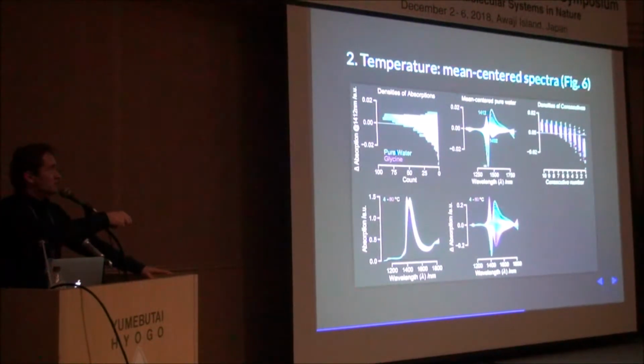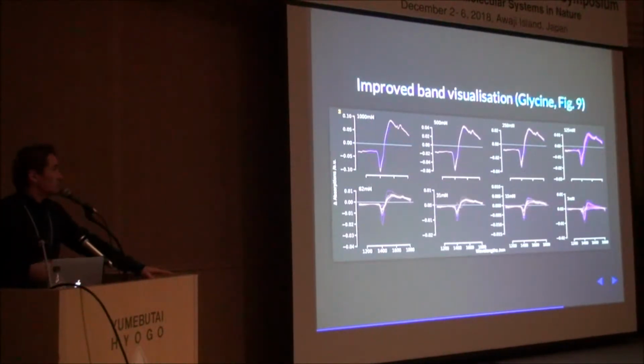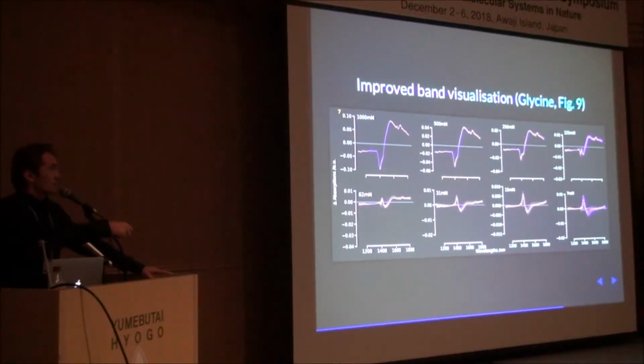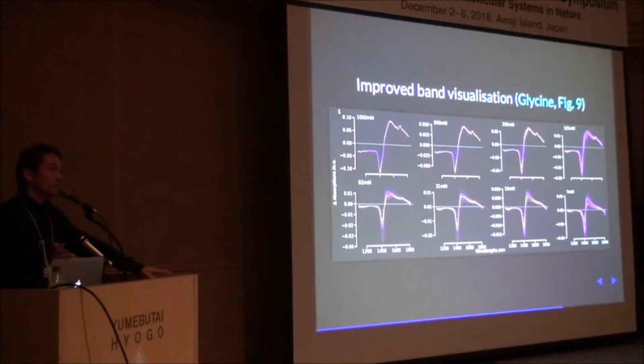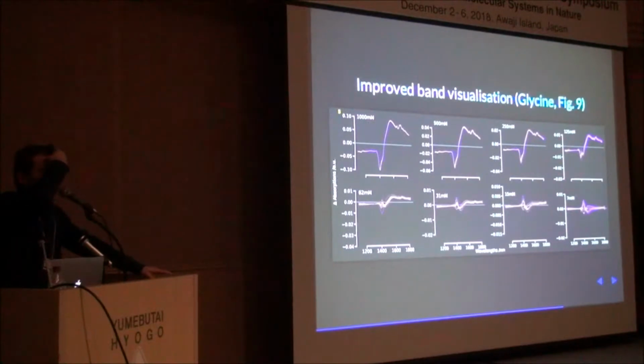This is the water that is colder than your sample, this is the water that is hotter than your sample, and this is everything in between. So even taking a lot of spectra, a lot of consecutives, and working with them together will not help, because the result will change dramatically. You get a lot of data, but your outcome is still poor, because a lot of those data are too far from your analyte, and they're just bringing in temperature noise.